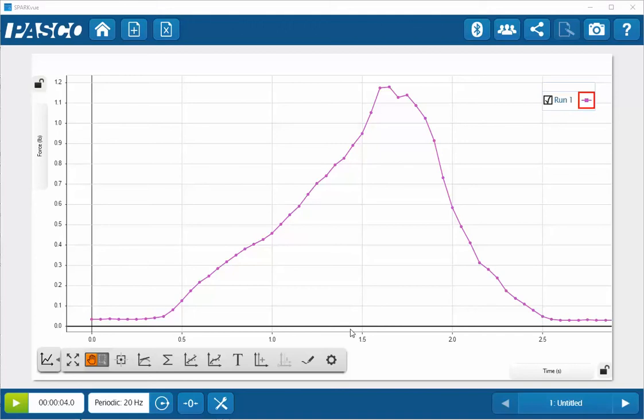This is a video showing the single data point selection process and the tools that are available through that. I'm going to place my cursor over a data point on my graph and click. Once I've done this, 3 different tools are now available. The far left one is the Smart tool, the middle one is the Slope tool, and then finally the one on the right is the Annotation tool.